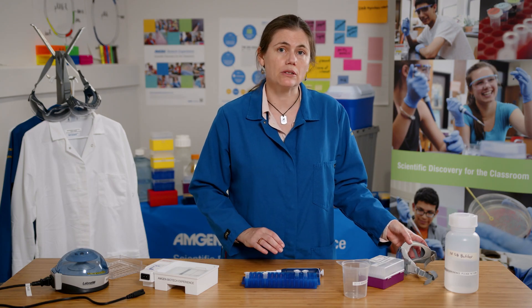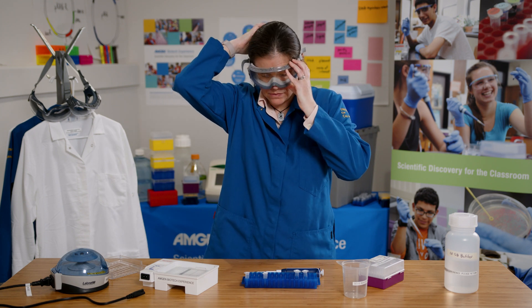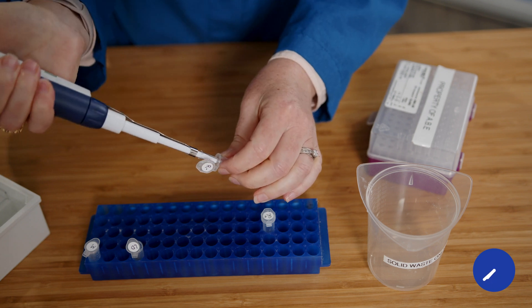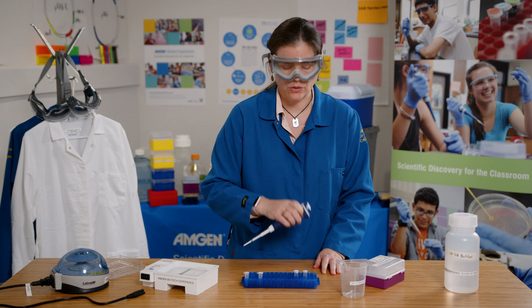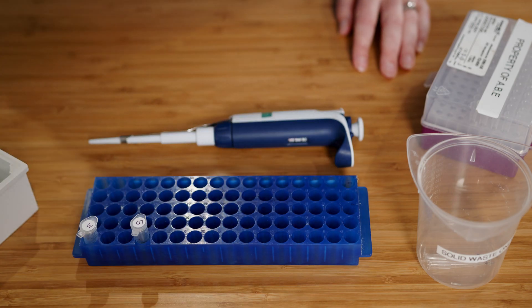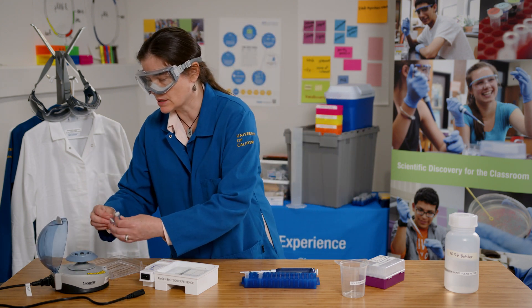Now I'm going to add two microliters of loading dye to my experimental and control tubes. Now I'm ready to centrifuge the tubes. Remember to evenly balance your tubes in the centrifuge. I'll only need to spin them for a few seconds to make sure everything is mixed and at the bottom of the tubes.